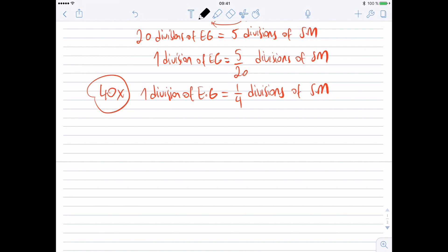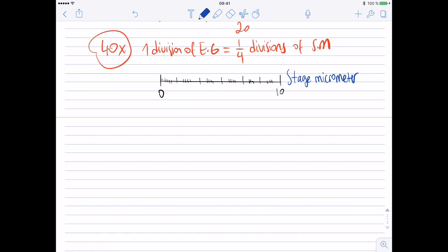What's the significance of this? Well, I can't directly measure the actual distance represented by one division of the eyepiece graticule, but I can calculate it using the stage micrometer. Remember, the stage micrometer is placed on the stage, and I can measure the real length of the stage micrometer using a simple ruler. I measured it as one centimeter.